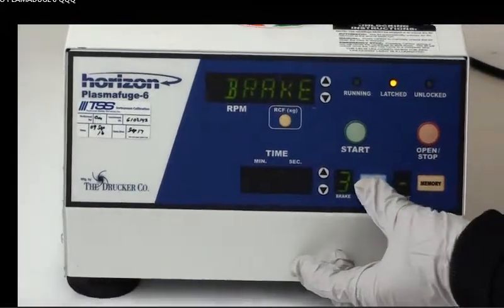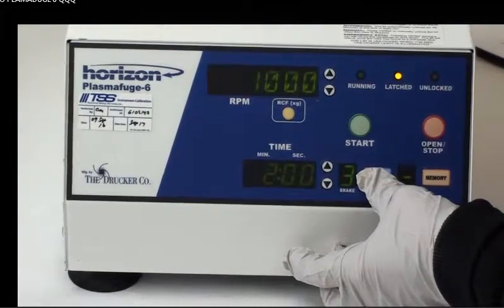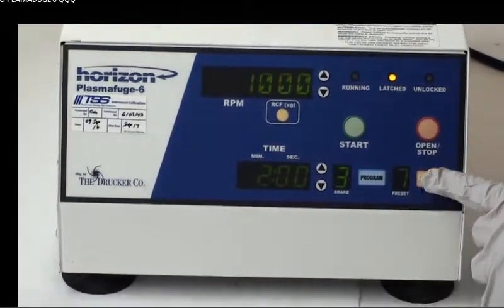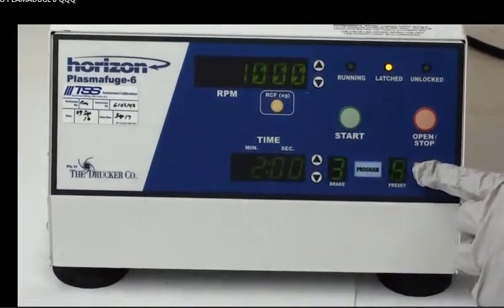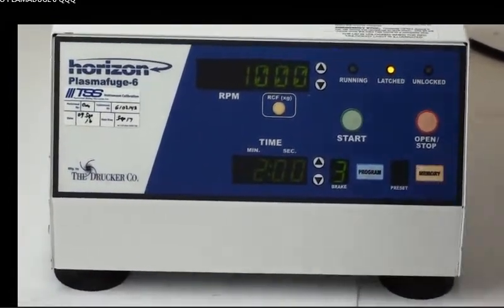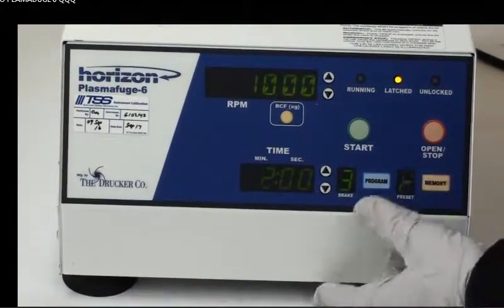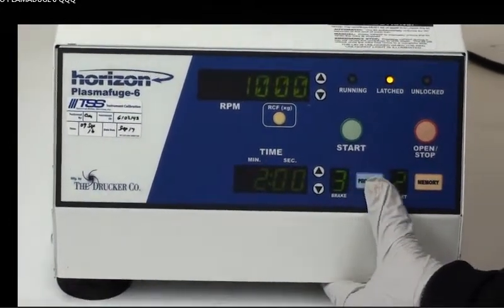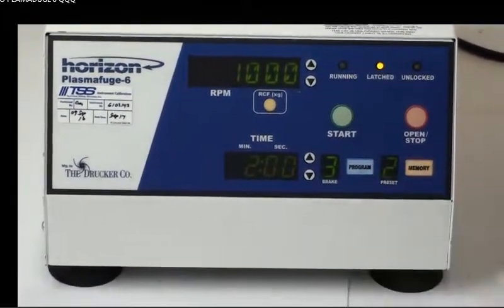I'm going to go back to program. I'm going to hold it down and choose the memory setting. You can actually save these settings in memory, so if you need to go back to that same setting you could automatically find it. Once I find the right memory I want to choose, which is two, I'm going to go back to program and hold it down. I'm just going to start it up again for you guys using that setting.